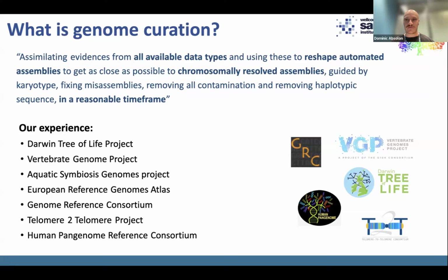Now, if any of you have ever seen a HiC map or worked in Pretext, let me tell you, you can spend hours and hours, if not days, weeks, months, poring over these maps and making tiny little adjustments, which is fine if you're in your research group and this is your baby genome, and you're really precious about it, spend as long as you like.